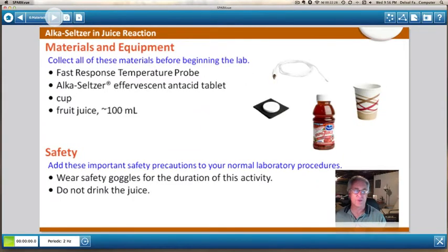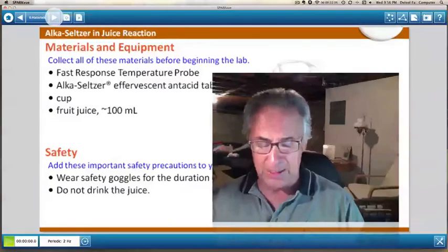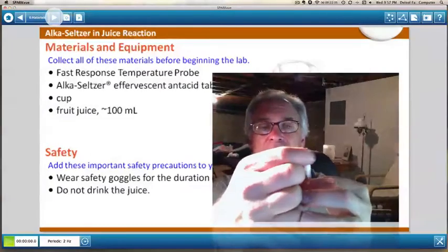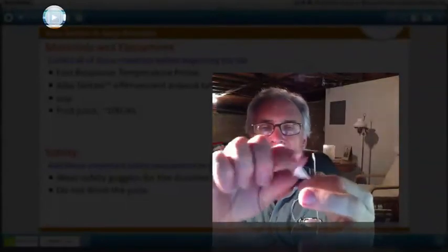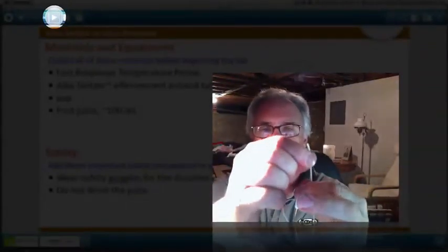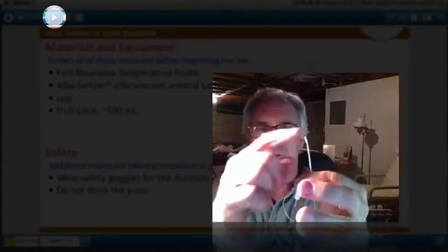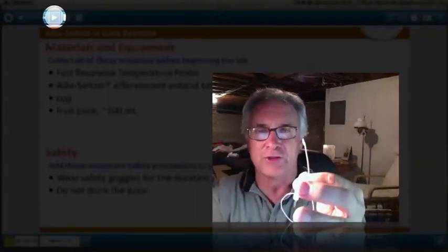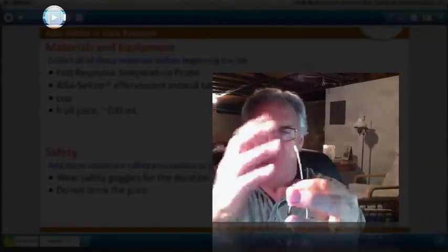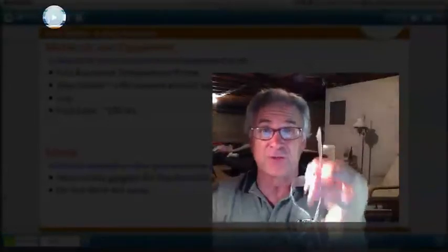So now you're going to the next page. And there's all the materials. For instance, one of the things you're going to need is a fast response temperature probe. And it looks like this. And you can see that this particular jack goes into the front of your data logger. This thing right here is the probe that is going to go into the juice. And that's the thing that's going to record the temperature. So that's a fast response temperature probe.